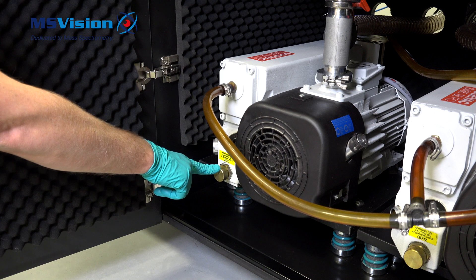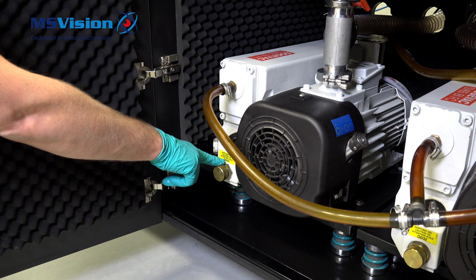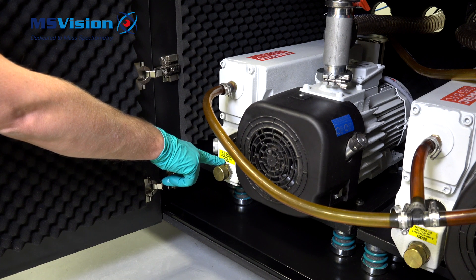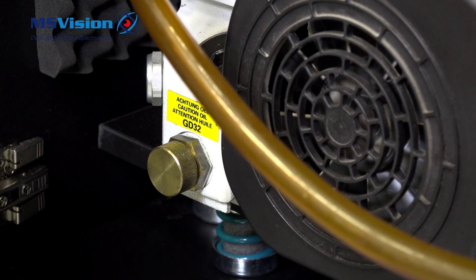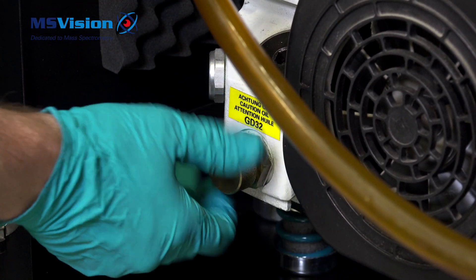There is a valve here where we can drain the oil. The label shows the old oil version, so be careful to use the correct type — ask if not sure which type to use. The system should be fully vented before we open the valve cap.